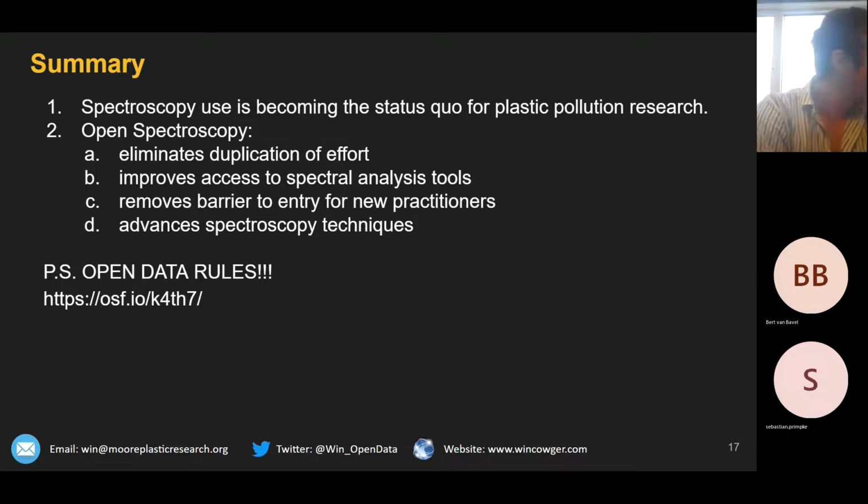One on this, if you have other combinations, we looked a little bit yesterday that we are using these silver filters, and we saw some background from that. That's the idea. If you give backgrounds, you will, one way or another, incorporate that into your database. Yeah.